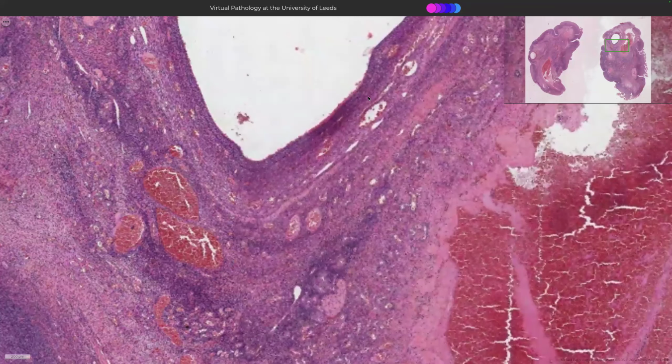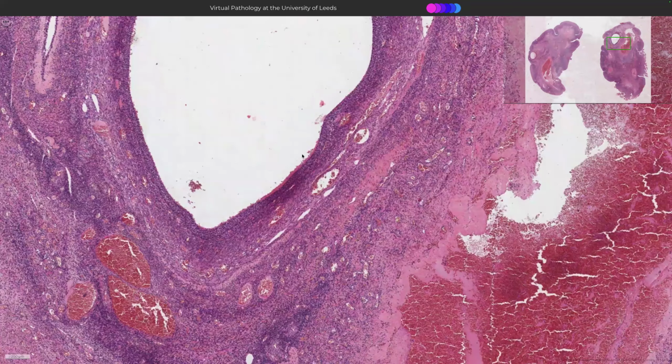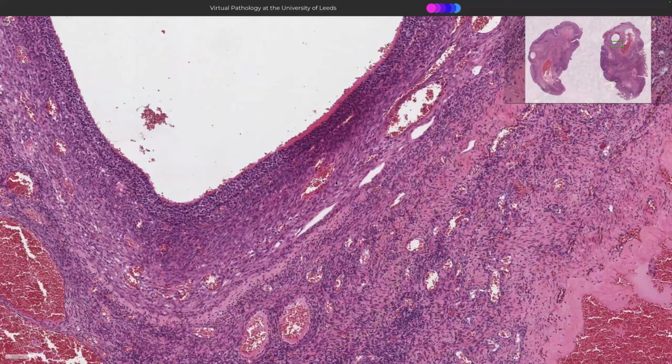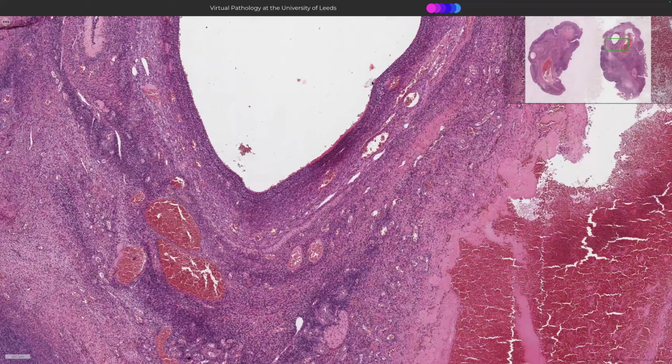And the slow transition. So who can remember what the granulosa cells are called when they surround the developing ovum? What are they called when they surround the developing ovum? Follicle? What's a cloud cell then? What's a cloud cell? Someone can tell me. Yeah, something like that. Cumulus cells, the cloud cells. I just like that because of its name.